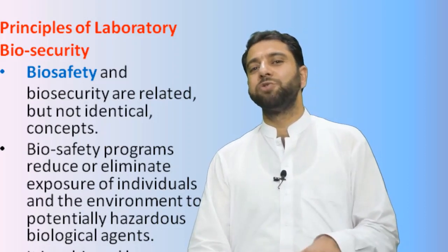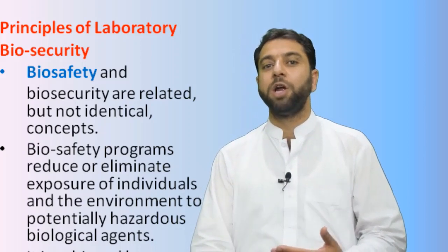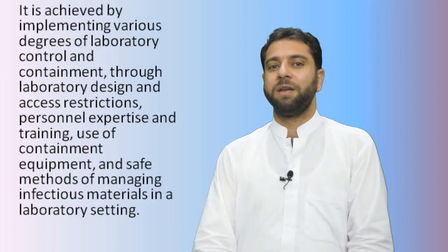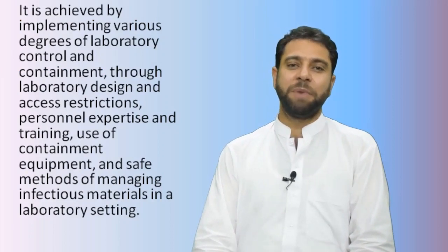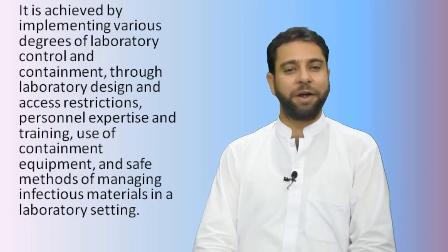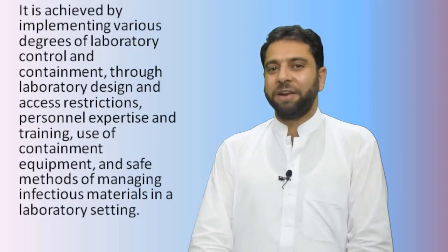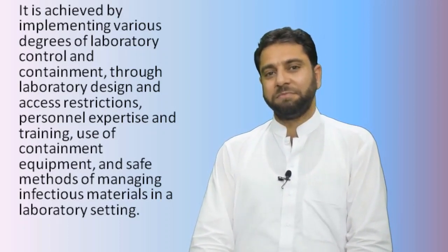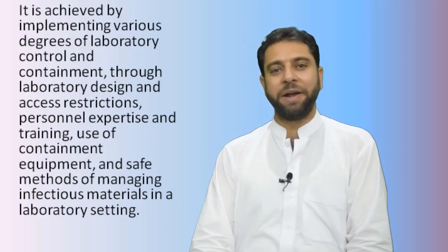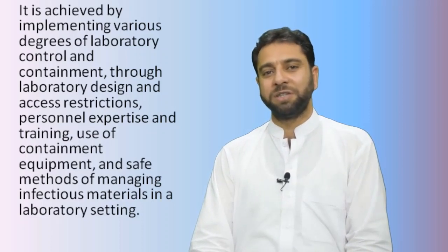Biosafety programs reduce or eliminate exposure of individuals and the environment to potentially hazardous biological agents. Biosafety is achieved by implementing various degrees of lab control and containment through laboratory design and access restriction, personnel expertise and training, use of containment equipment, and safe methods of managing infectious materials in a lab setting.